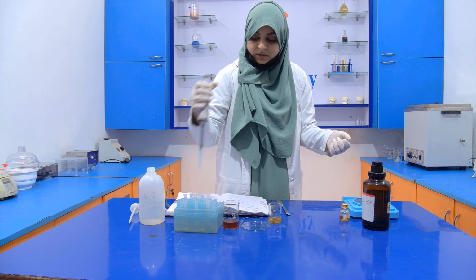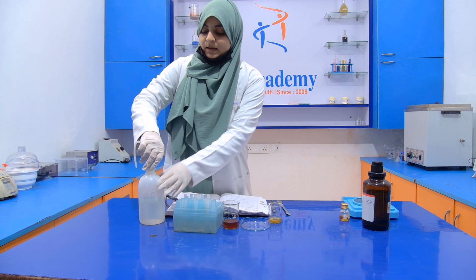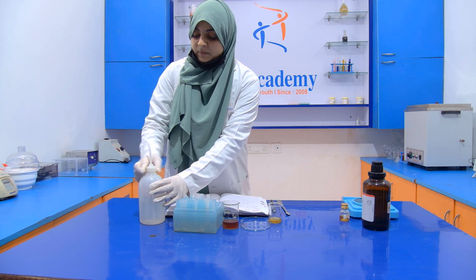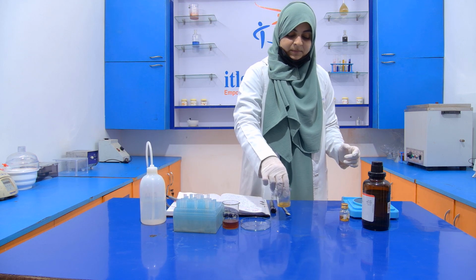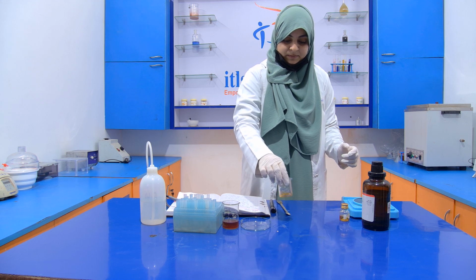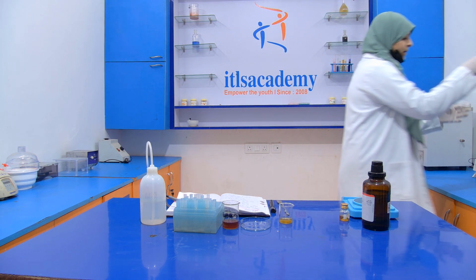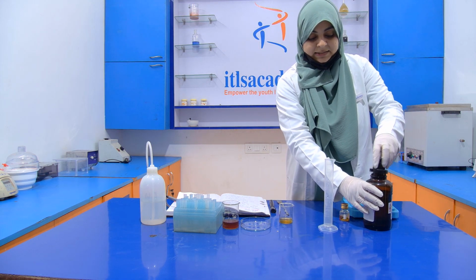Now extract it with the help of diethyl ether, and the amount of diethyl ether will be 10 ml. Mix it properly. Now take 10 ml of diethyl ether with the help of the measuring cylinder.